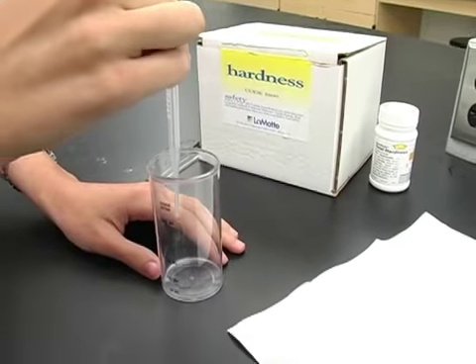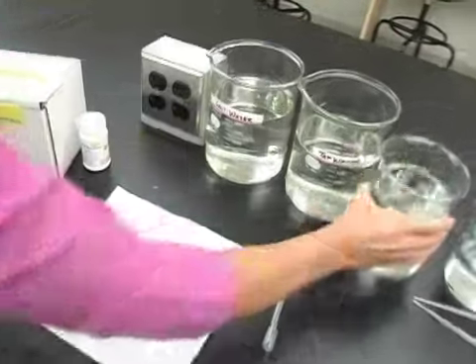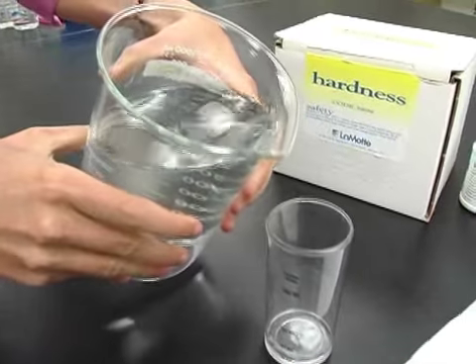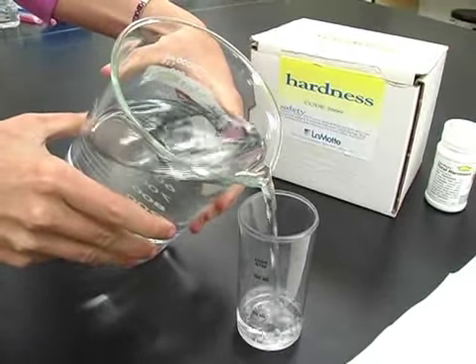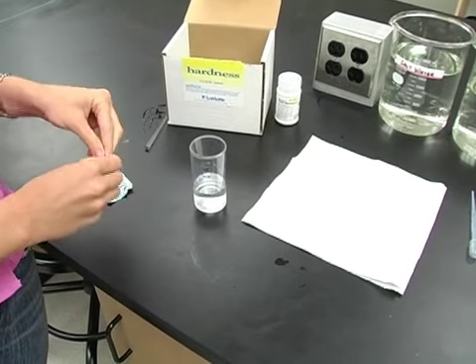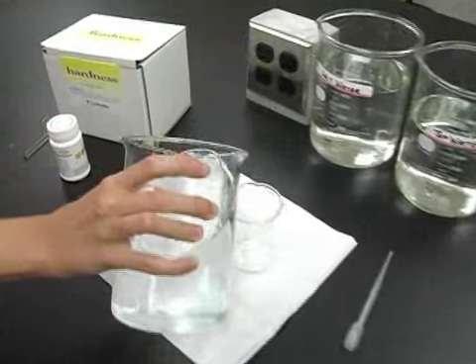If you are testing a sample of seawater, pipette 2.5 milliliters of your sample into the test tube and dilute up to 50 with DI water. Add the tablets one at a time until the color changes. Then, multiply the number of tablets used by 800 to obtain your ppm of total hardness.